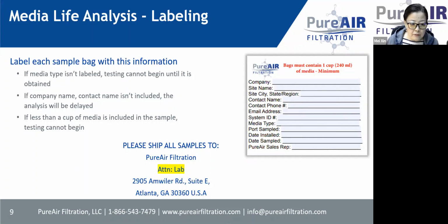So a bad labeling, including you don't have media type, that's the number one errors. And you don't have a company name, contact name. We don't know where to ask a question, where to send a report, and you don't have a sample ID. Sample ID, sometimes you create your own system ID, and you create the location ID, and we can help you track the system performance later.